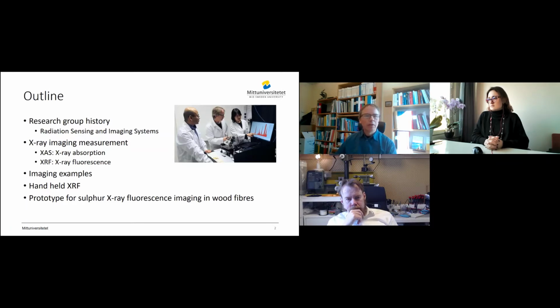The outline of my talk is that I will say a little about my research group, Radiation Sensing and Imaging Systems, and why we are working in this field. Then I will explain the difference between absorption imaging, XAS, and fluorescence imaging, XRF.